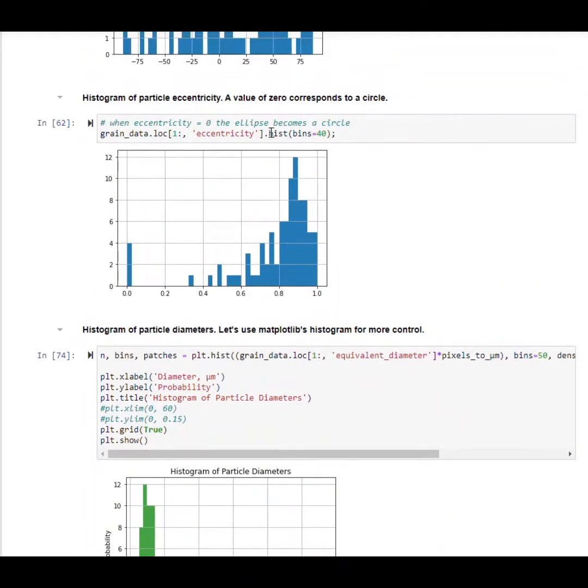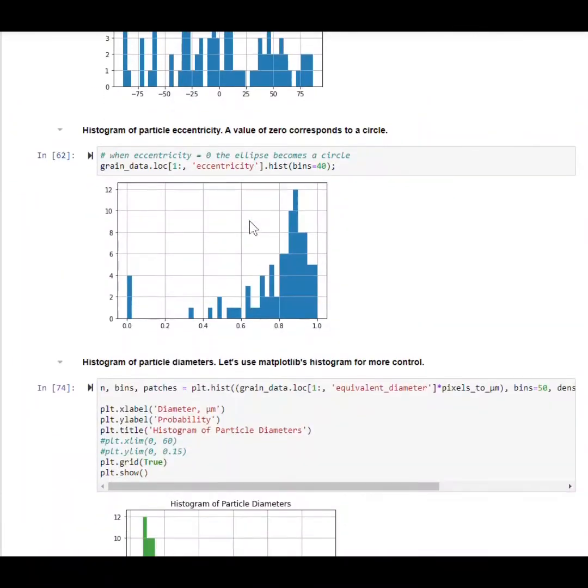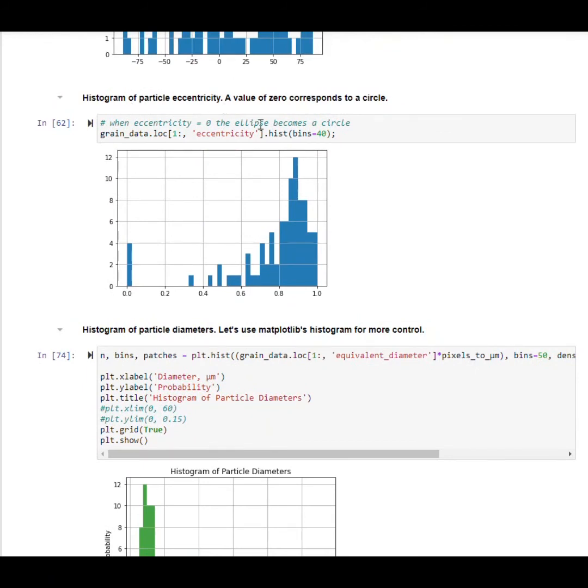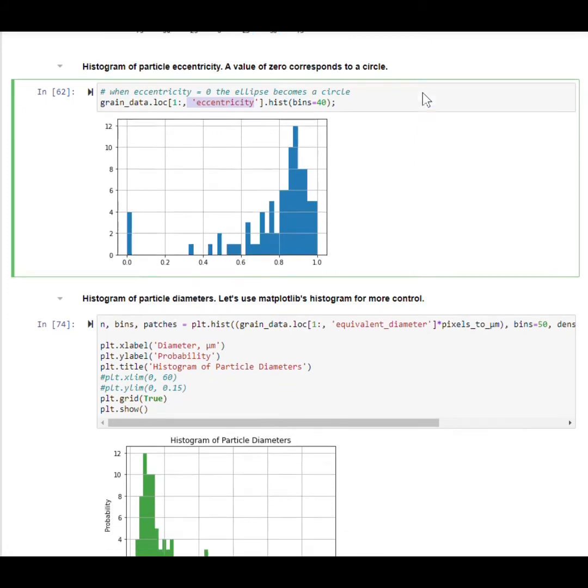The other thing we might want to look at is how circular the particles are. In this case, they're clearly not at all. But if they were circular type, then this would be useful information. So I'm going to just grab that from the eccentricity value and run a histogram on it. Okay. And 0 is actually circular, and 1 is fully ellipse. Actually, I should probably check exactly what the ratio for the long and short axes is for the ellipse at 1. But this is circular. So you can see that they're not circular at all, which we expect.